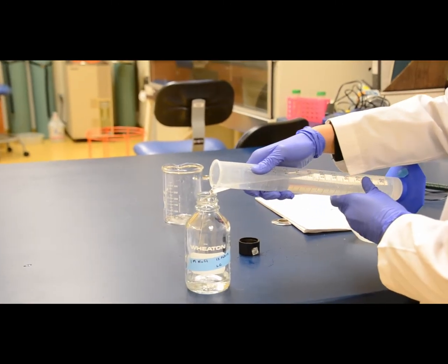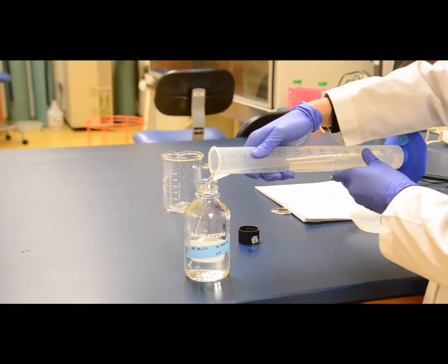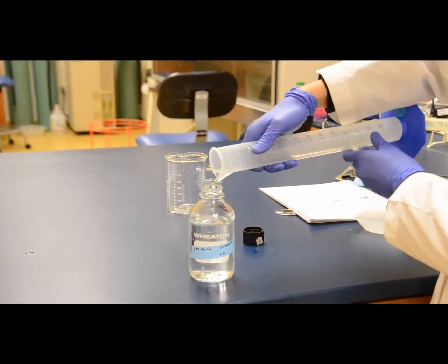Once you have the appropriate amount of solution, you can transfer this to a clean container and cap it off. And there you have it, we're done.